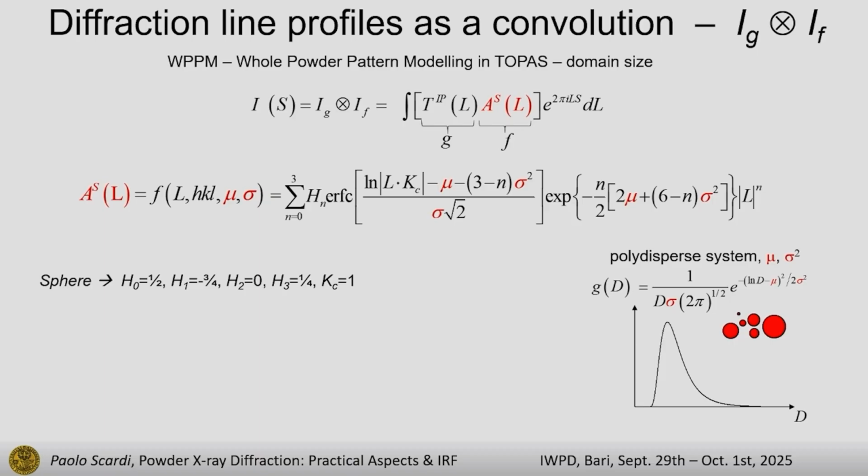So let me show you how it works. With Topas, you include this macro file, which is available among the files you can download. And as it is easy with Topas, when you write a macro, whatever macro, you can include it with a .inc file. It means Topas carries along all that is in this file. And then you call the macro with the name you gave it.